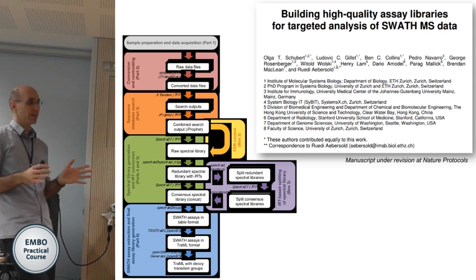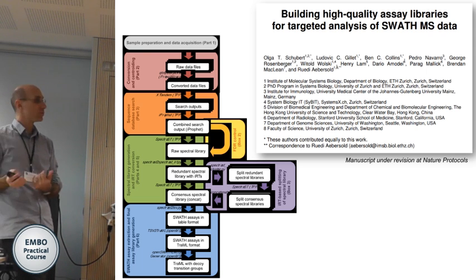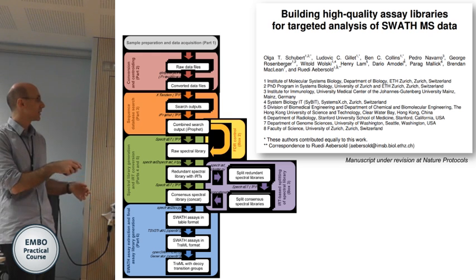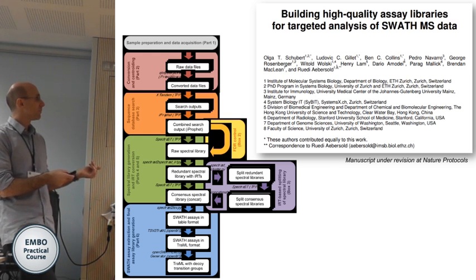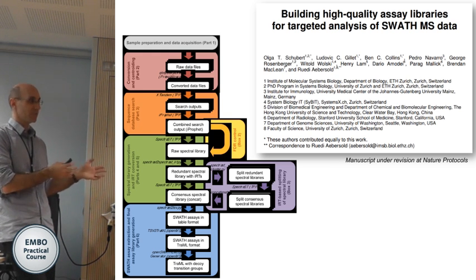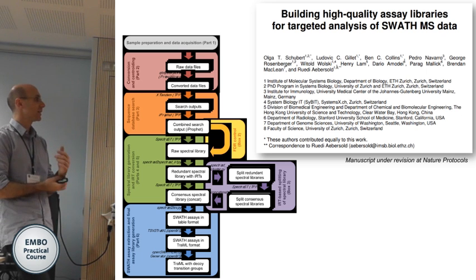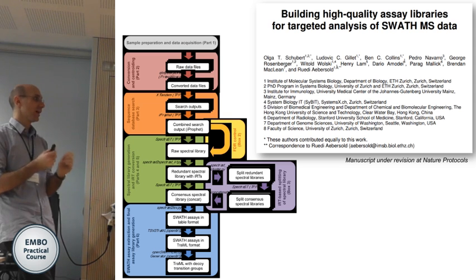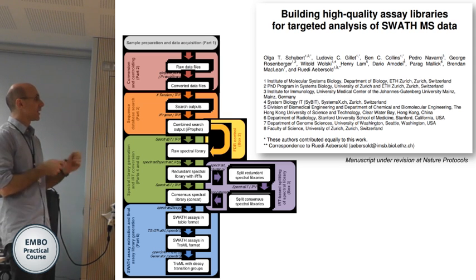So these tools can be adapted. Most of those things you can also do in Skyline, and you can do maybe with your own pipeline, being BiblioSpec. We are using SpectraST because in our lab we are TPP-centric. But you can do many of these steps. You can basically apply it to any of the tools you might already be using. You just need to tweak and think about these different tips a little bit in your own workflow.